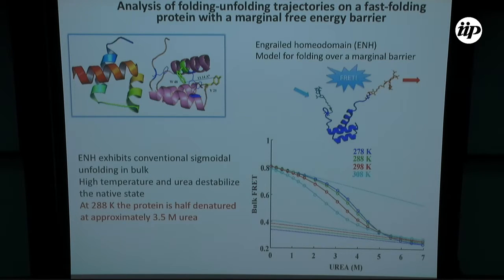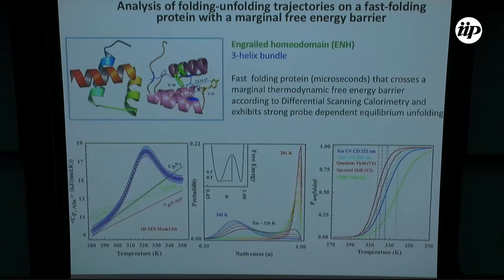But this is the hardest part of this. I mean, the experiments seem complicated, and they are. The analysis is complicated also. But the hardest part is doing all the chemistry and making sure that you put these dyes there, and that they didn't screw up the protein. And that's why most people actually skip that process and then take the experiment and do it. But you have to do it. I mean, this is like, let me just go back here.